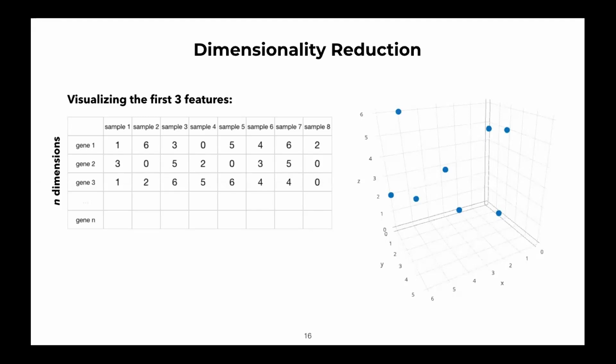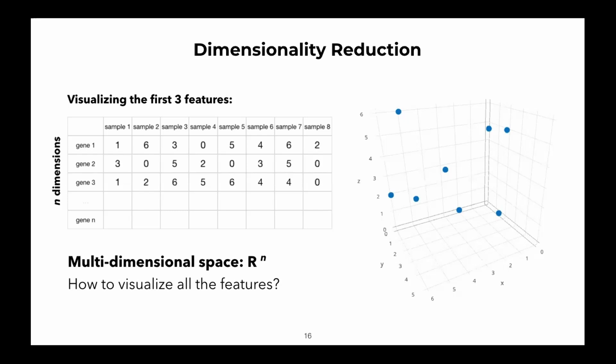How would we do that? It is not possible for us to humanly plot this into a multi-dimensional graph and see it. But that is possible for the machine learning technique called PCA, which can plot multi-dimensional data so we can see the visualization. So how does PCA work?